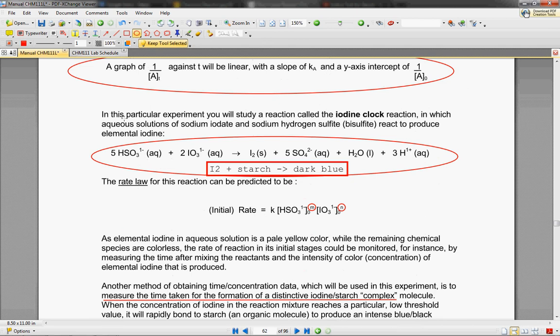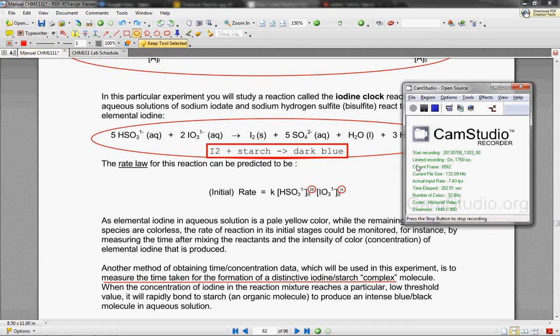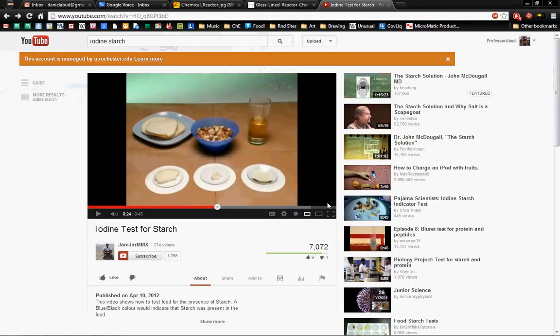In this lab, we're going to be using this reaction right here. The way we're going to determine if there's any iodine left - essentially we're going to be making pure iodine. We're going to be using HSO3 and IO3 to make I2, and I2 is just pure iodine. The cool thing about iodine is that you can mix it with starch, and it makes this dark blue compound.